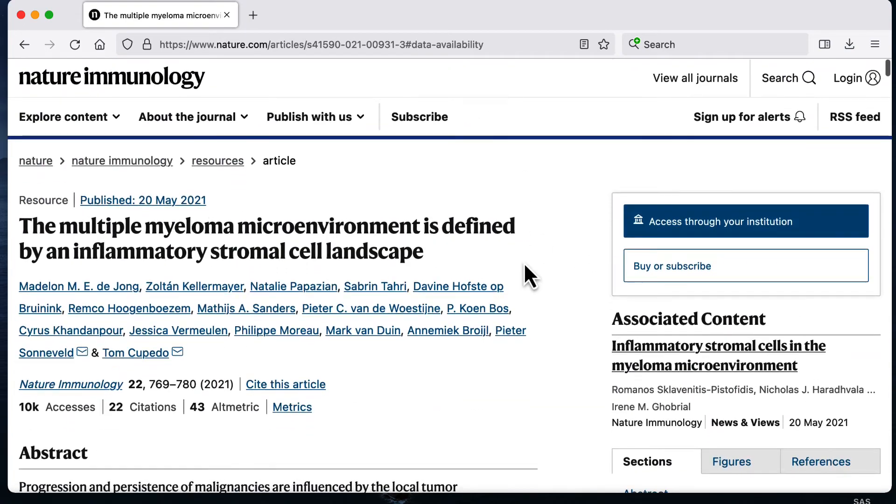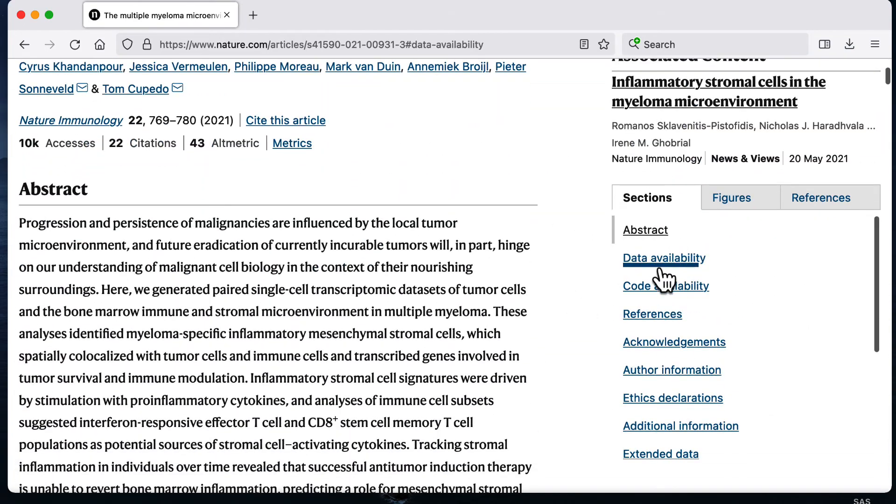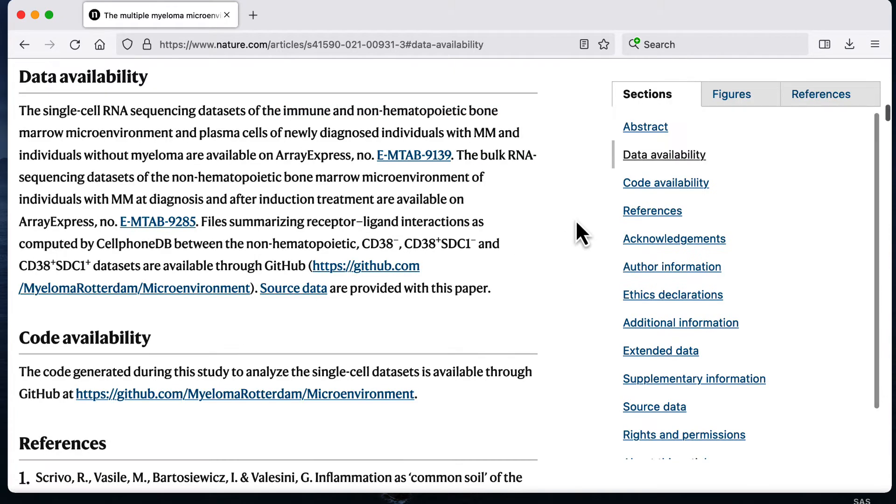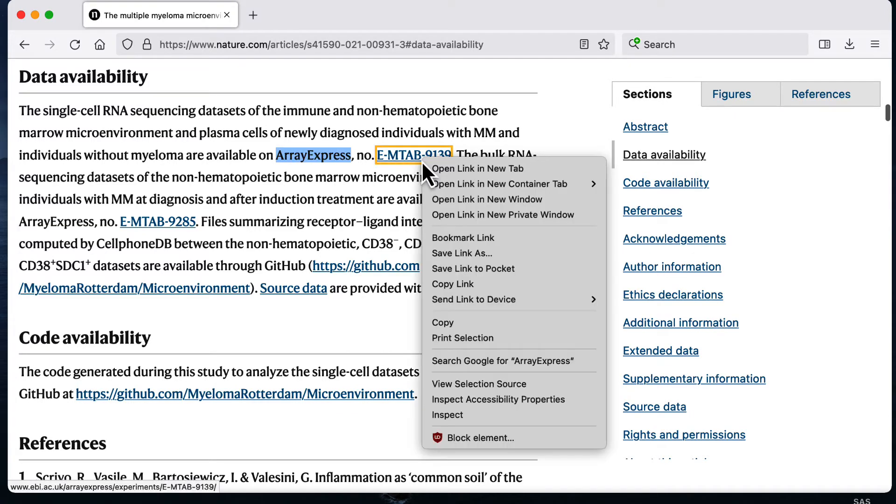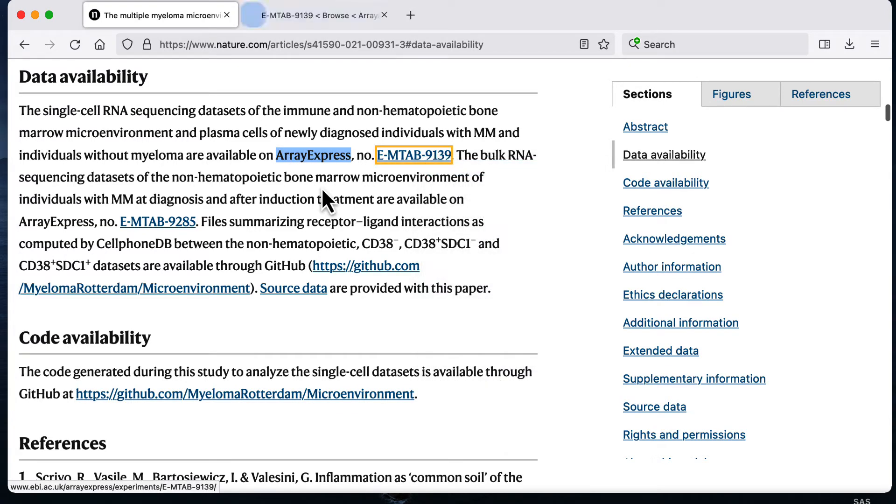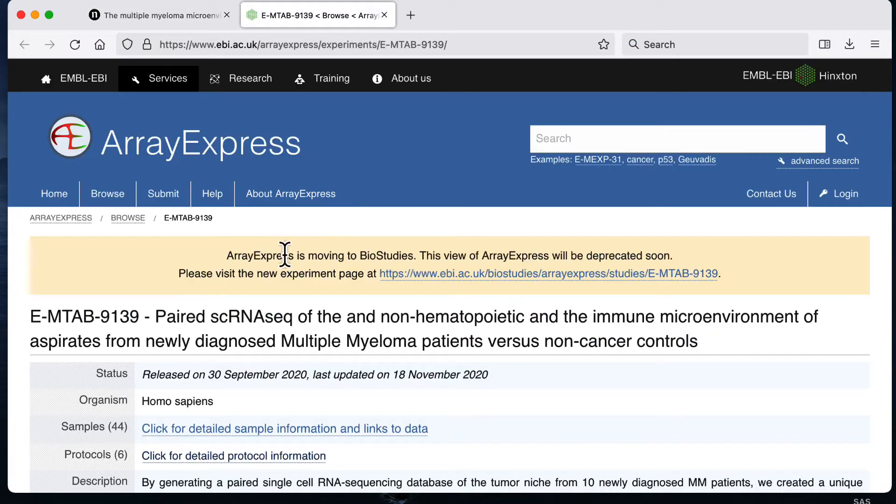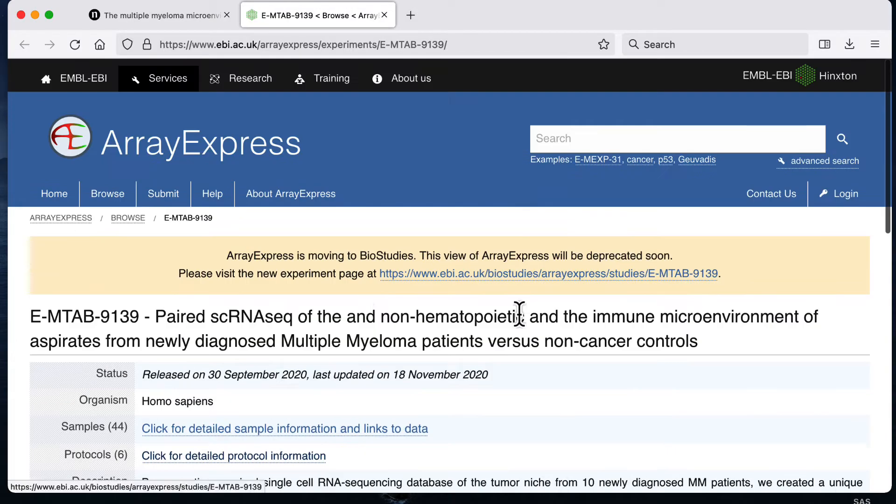When I go to the paper there's a section called data availability that explains how you can find the data. When I click that section, this paragraph gives me a link to Array Express, which is the website where the data is hosted. When I click this link it says that Array Express is soon going to be a website called Bio Studies.